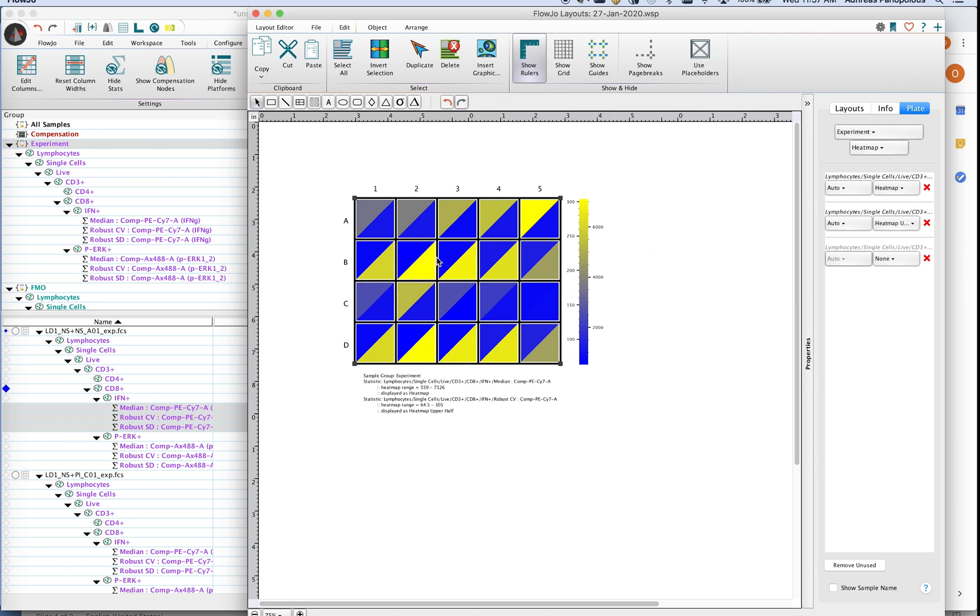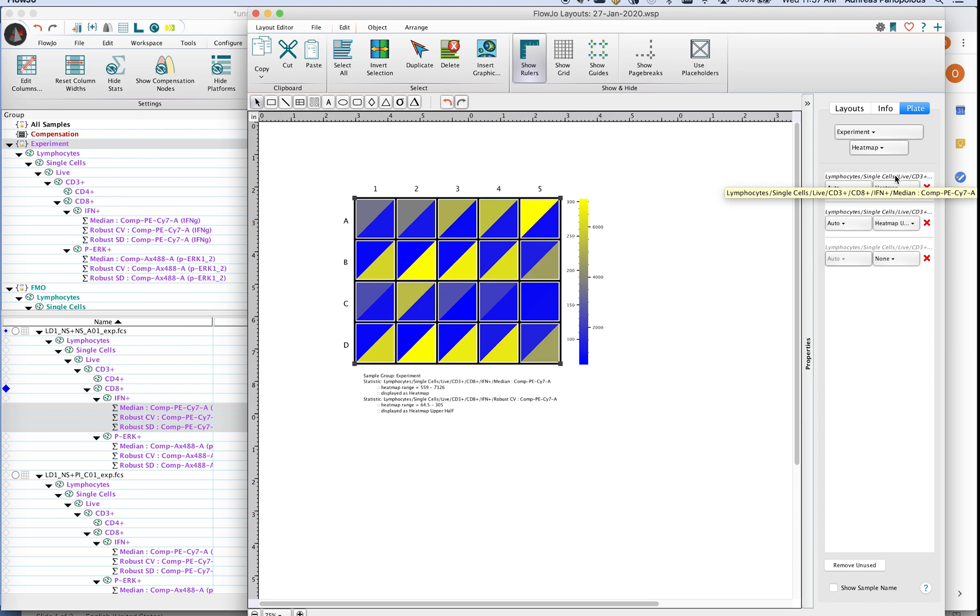You will notice in the plate tab here there are a series of boxes. Each one of these lines actually is telling you which statistic is active. In this case it's the MFI of interferon.